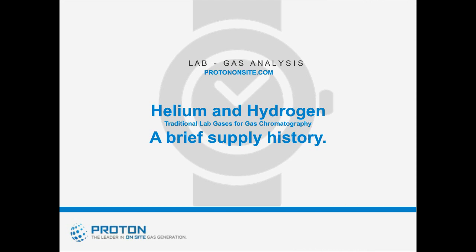Let's start our discussion about lab gas supply with helium and hydrogen gases. These gases bring tremendous value to the operations they are used in because of their inherent low density and high purity for carrier gas and FID gas chromatography applications. With that value also comes challenges. The majority of those challenges can be identified with the supply and storage logistics associated with them.